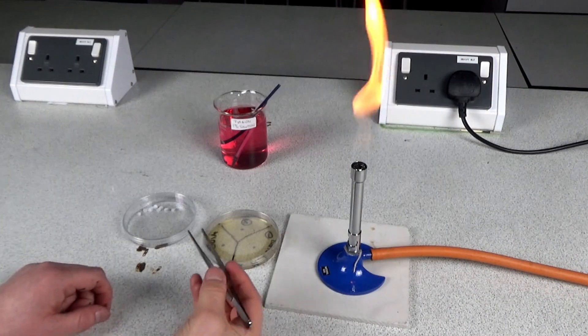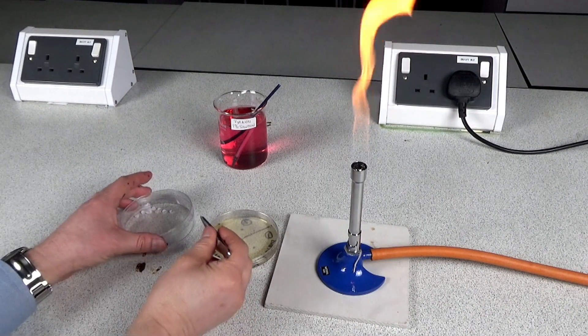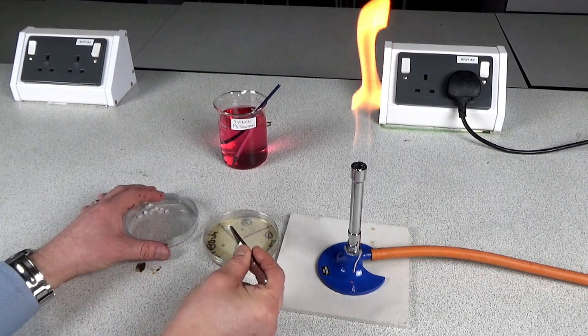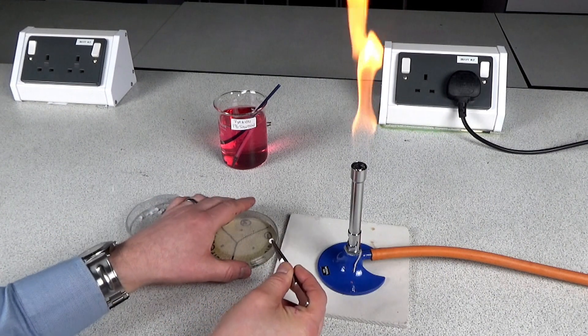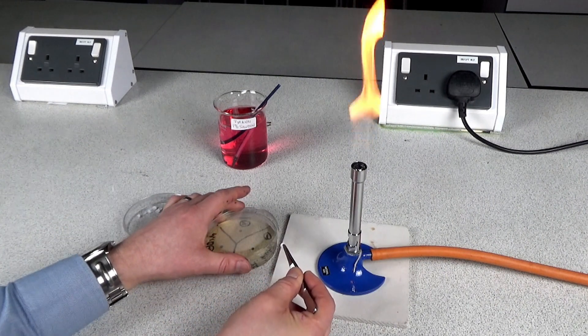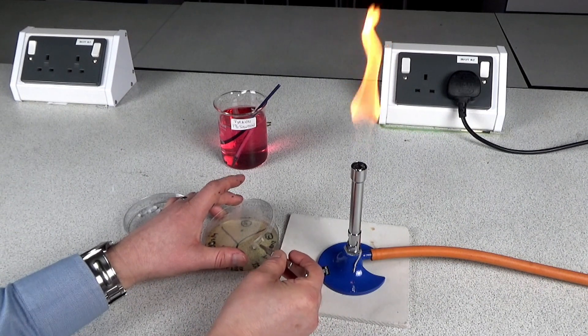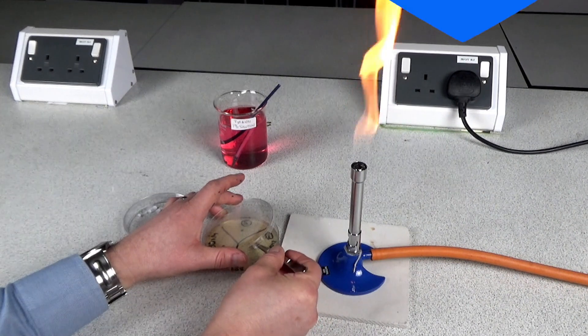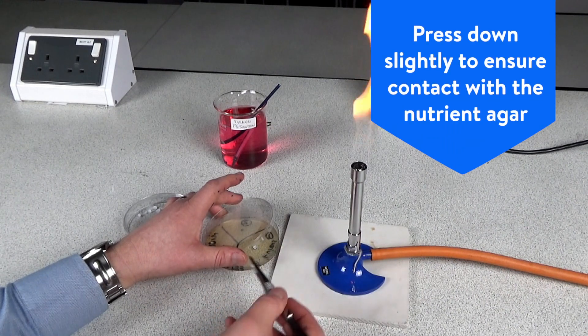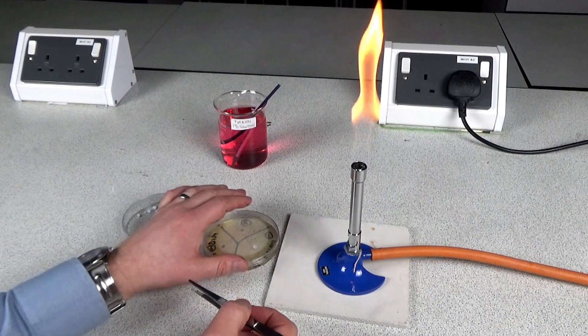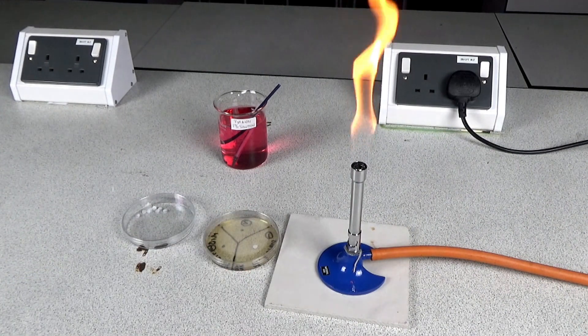Your students then use a pair of forceps to take one of the discs that's been soaked in one of the antibiotics, and this one I've got here is penicillin. They lift the lid of the petri dish slightly, place it onto one of the three areas on the dot that they've got, and they press it down slightly to ensure contact with the nutrient agar. They then replace the lid and repeat it with two other types of antibiotic.